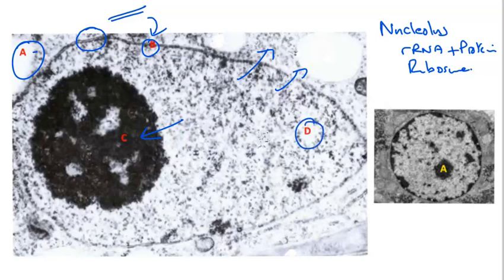D is referring to what we would call the nucleoplasm. The nucleoplasm is the nucleus's version of the cytoplasm. And if we look into this region here, we can see that there are a combination of slightly lighter gray colors, and then of course regions like this of slightly darker colors.